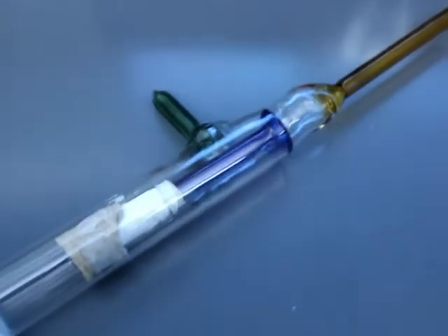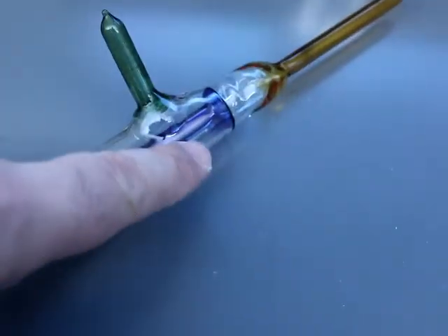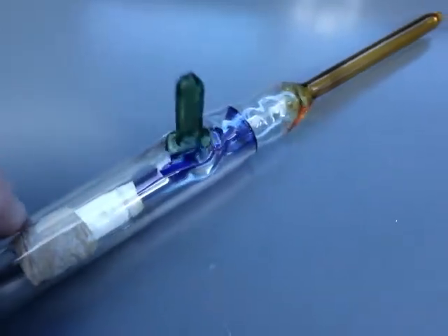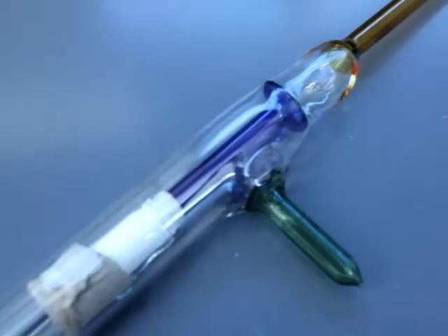So how did I do? Alright, I haven't taken it apart. I let it cool down. We can see side seal, ring seal, straight seal, and so far everything is intact, which is good.